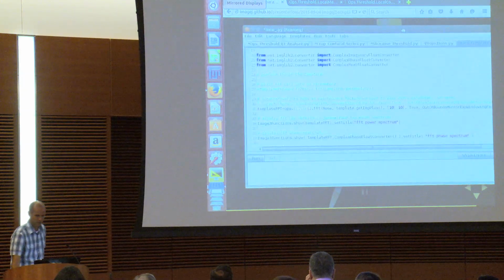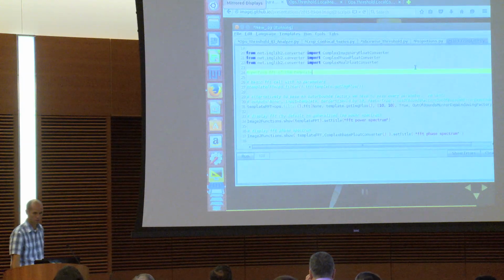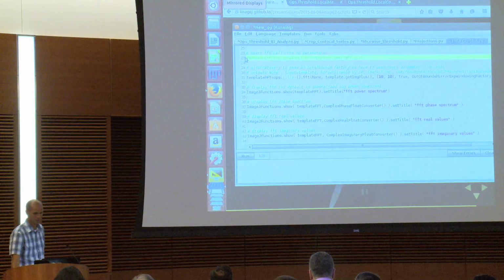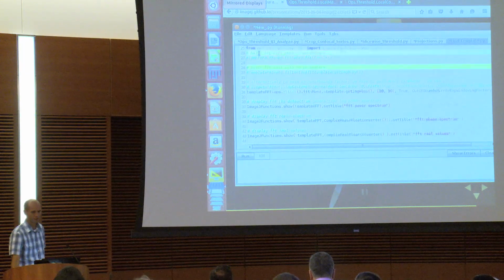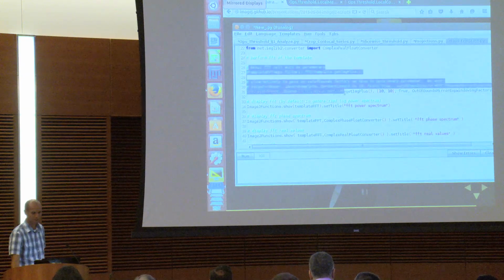There's actually a question that gets asked on the listserv quite a bit. People want to know how to do FFTs. So there are some ops for FFTs. In this example, I have a basic FFT call with no parameters, and then I have a more complicated looking call.